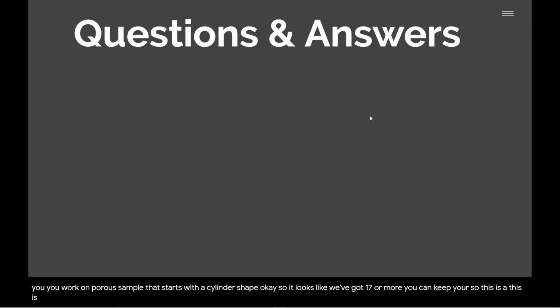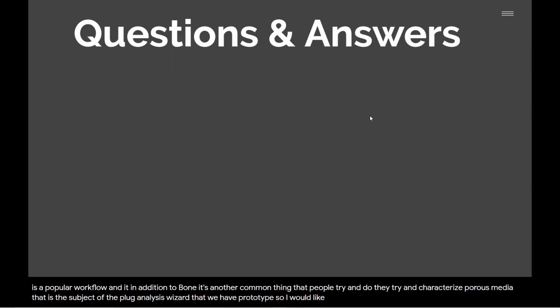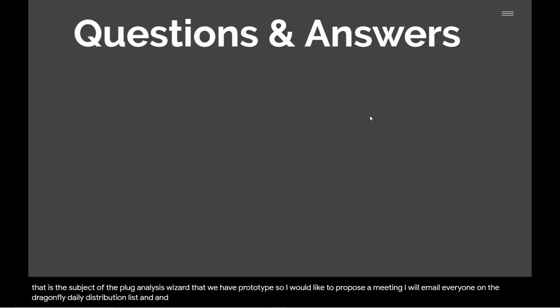So this is a popular workflow, and in addition to bone, it's another common thing that people try to do. They try to characterize porous media. That is the subject of the plug analysis wizard that we have prototyped. So I would like to propose a meeting. I will email everyone on the Dragonfly Daily distribution list and announce a meeting probably about a week from now to get user feedback on what you want a plug analysis wizard to tell you.